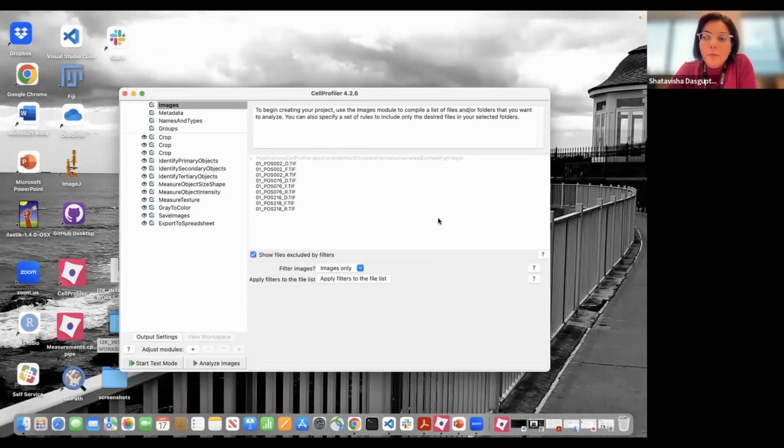Why does the Run Cellpose plugin not work in CellProfiler? Can you demonstrate how the plugins work? Okay, I see Beth has already answered it. Unfortunately, this is a very much introductory workshop, so I don't think it will be within the scope of today's workshop to check that. But once we go into breakout rooms, we can give it a try.